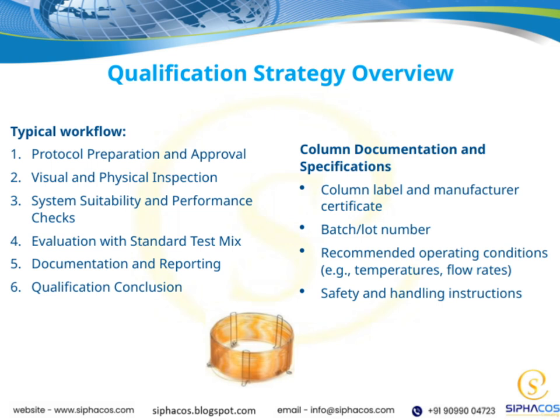Safety and handling instructions are equally critical. They help prevent accidents and ensure proper use of the materials. Moving on, the qualification strategy overview provides a structured approach to validation. The typical workflow starts with protocol preparation and approval, which sets the foundation for the entire process.